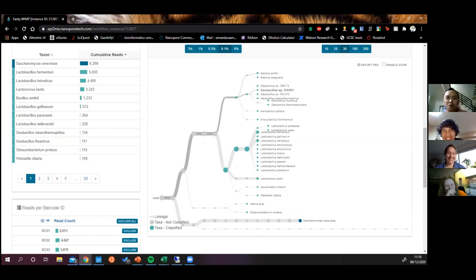Exactly. So if we're going to make our own database, for instance, just unique species including endemics that are present in our sampling area, would you recommend we include the whole genome, or are specific barcode regions sufficient?